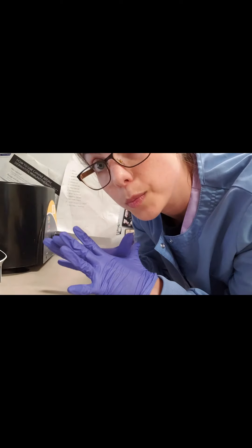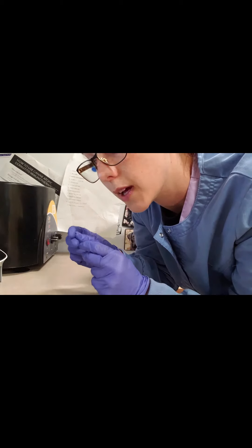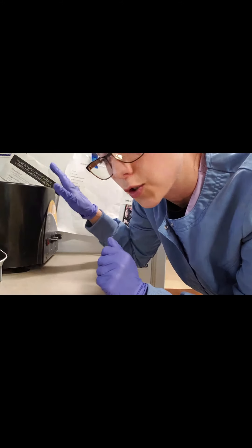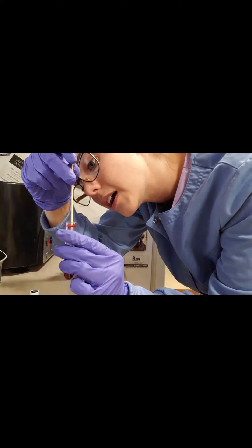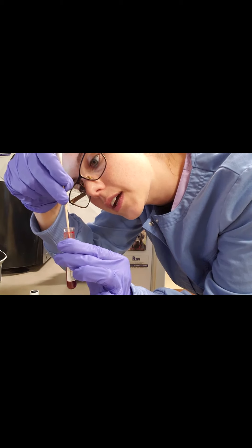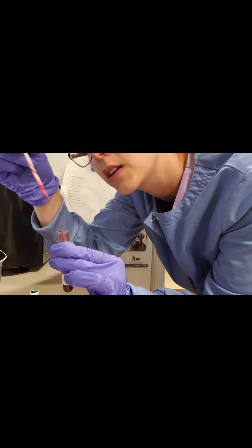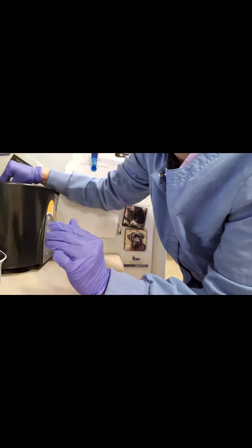Now that we've let our blood properly clot, we are going to rim the samples — just get rid of any chunky bits of clots — and then put them into our centrifuge to spin them. Taking the back end of a Q-tip, we just want to gently get excess bits off of the side there, then discard that and put that one in.